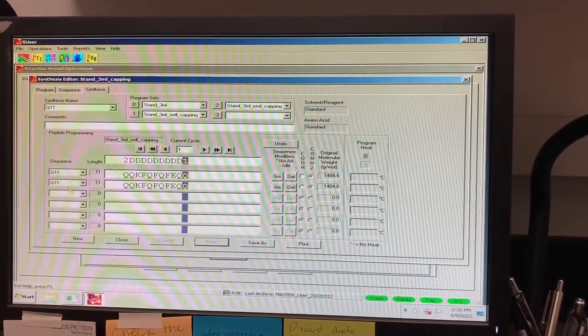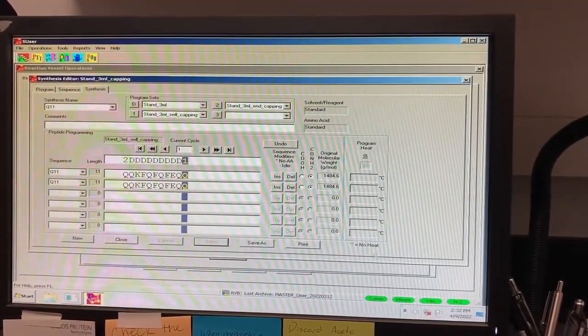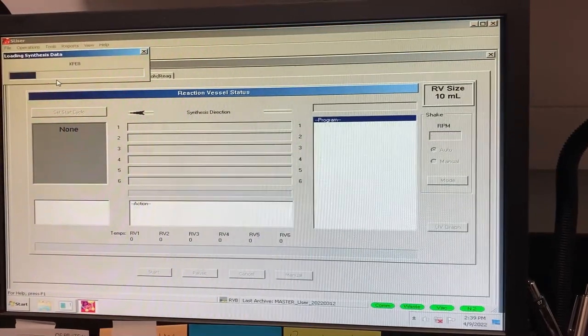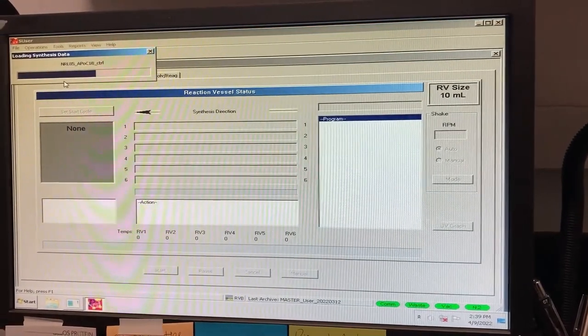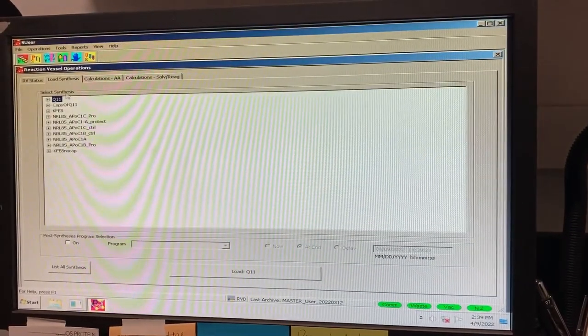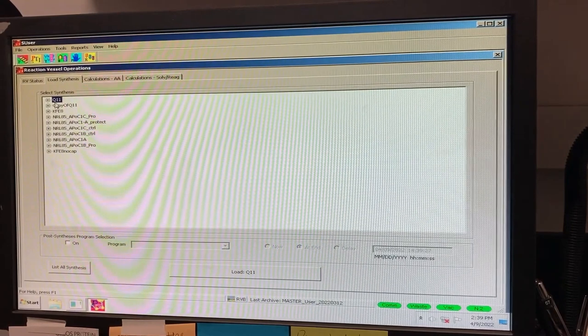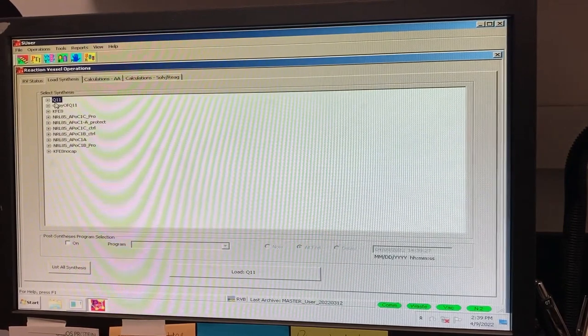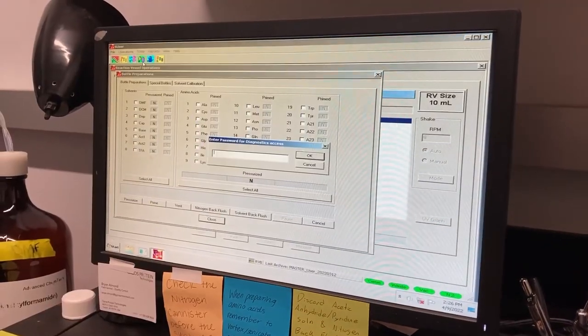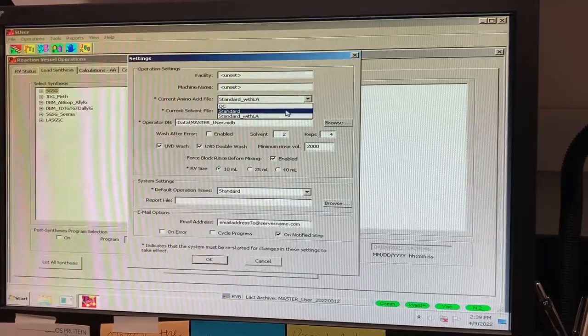Now, you can select the Load Synthesis tab in the main window. If your synthesis file does not immediately appear, select List All Synthesis. If your file still does not show up, try logging in or out in the Tool tab, or changing the amino acid file under Settings.